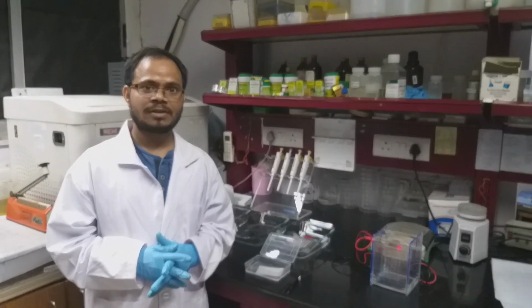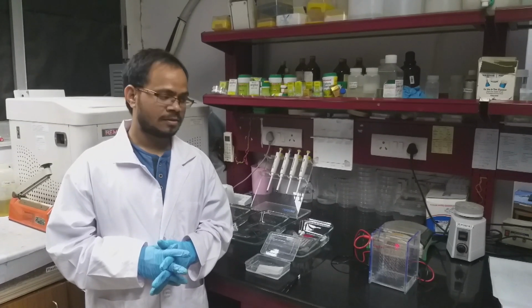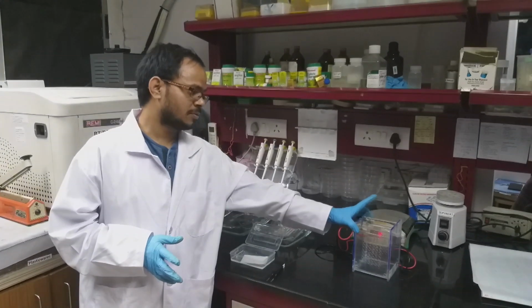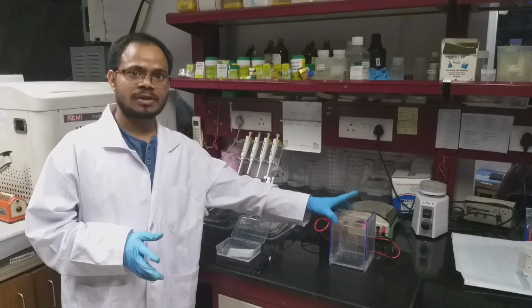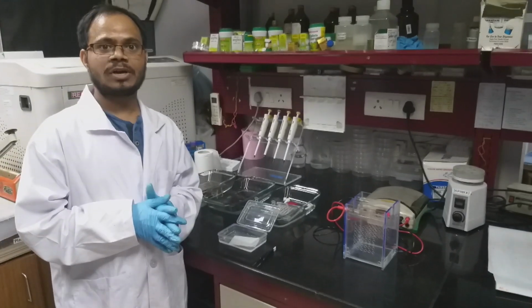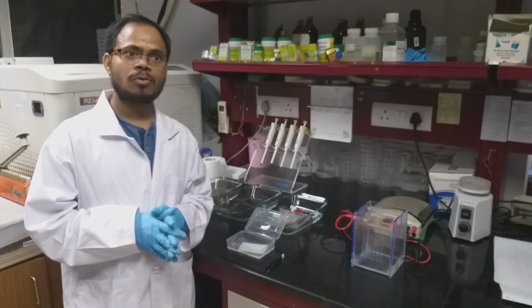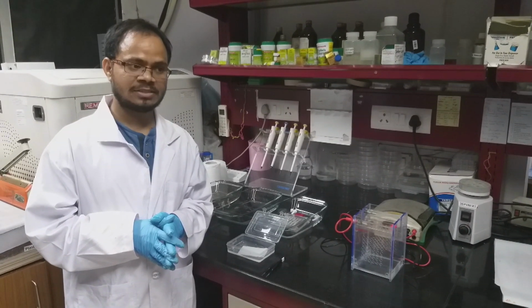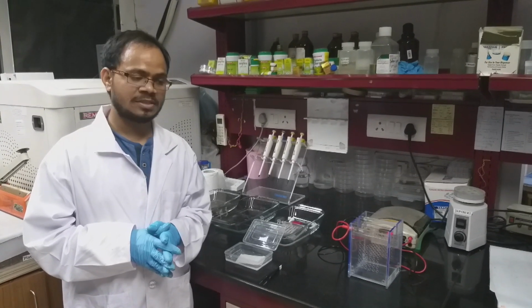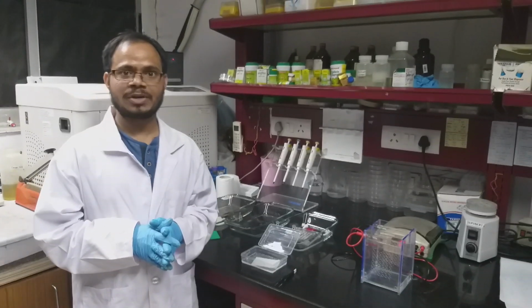For doing Western blot, we need membrane, transfer buffer, and the transfer medium. This one is what we use to transfer the gel to the membrane. Here the membrane can be of two kinds. One is nitrocellulose, which has low protein binding efficiency and is hydrophilic in nature. Another membrane is PVDF, a hydrophobic membrane with higher protein binding capacity.